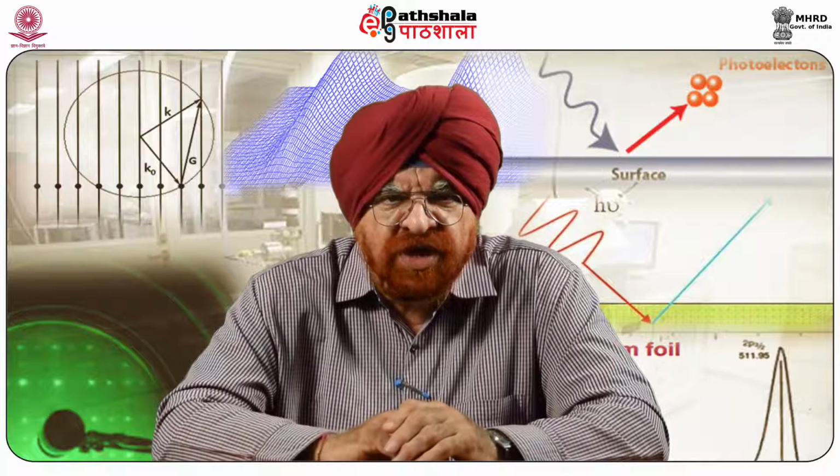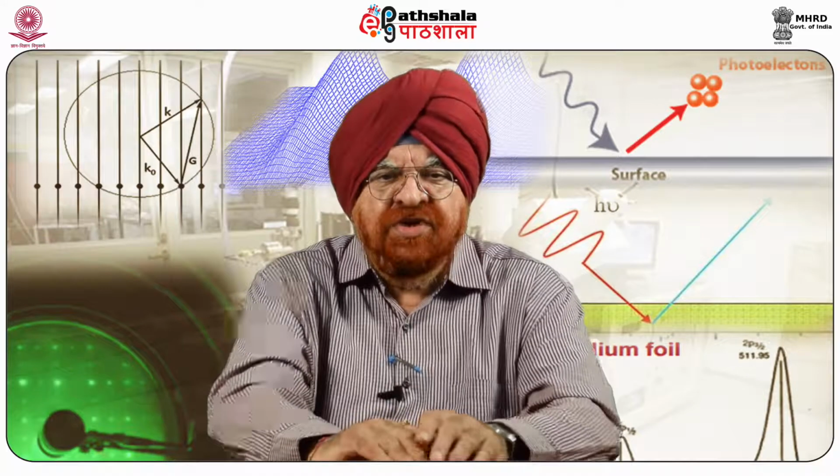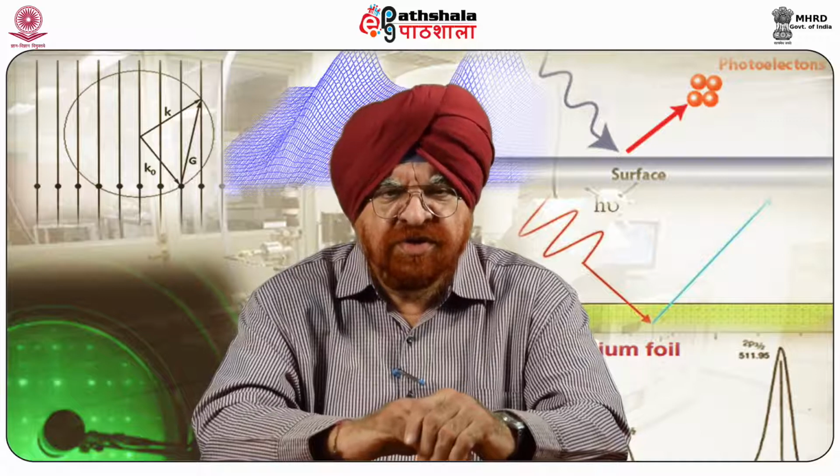MFM was introduced shortly after the invention of the AFM by Martin and Wickramasinghe in 1987 and became popular as a technique that offers high image resolution without the need for special sample preparation or environmental conditions.